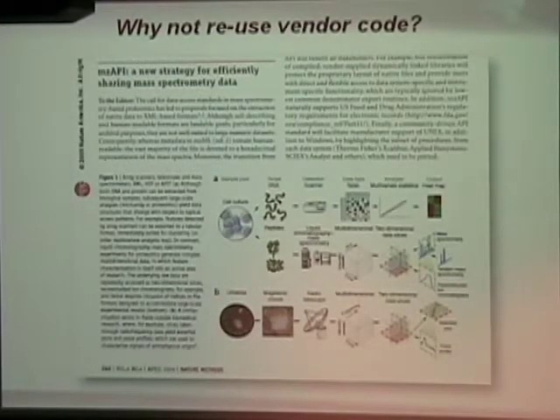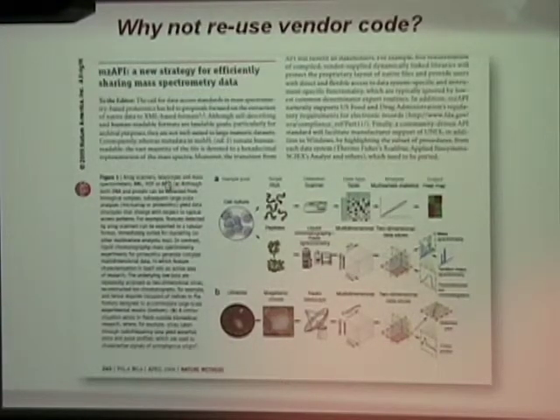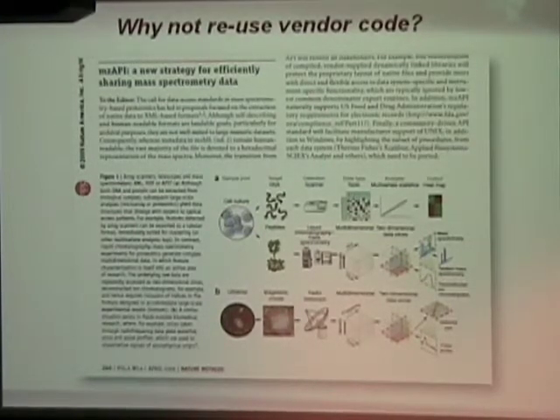Today I'm just going to show you the end game from our perspective, which is to access the original raw data. And I'm sorry that we're getting into this sort of nitty-gritty stuff, but we are not yet, in proteomics, we are not mass spec-based proteomics. We're not nearly as advanced as in the microarray world, where you can go to a standard resource and things are really worked out.